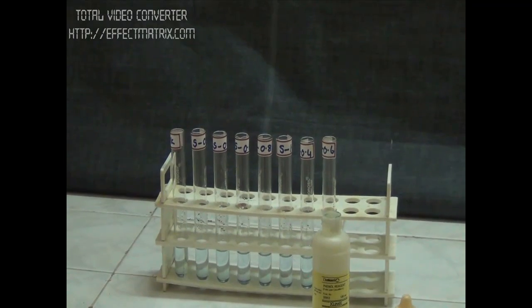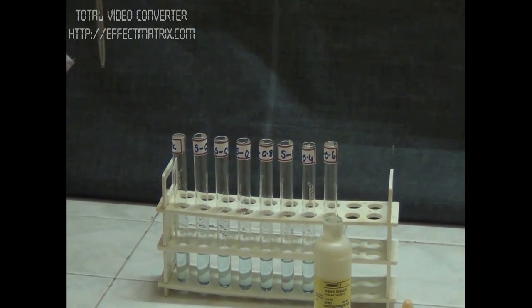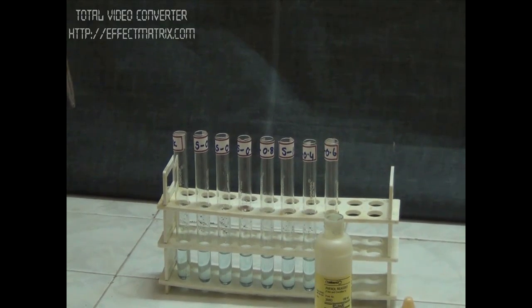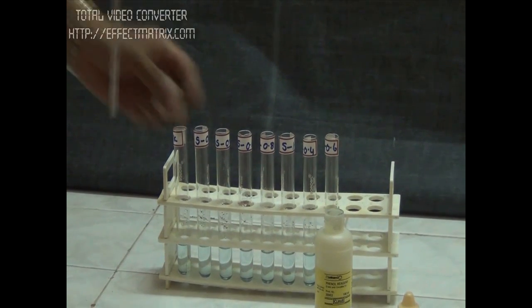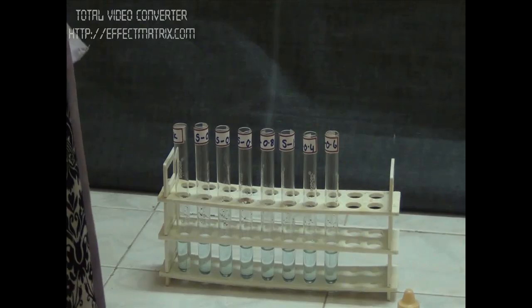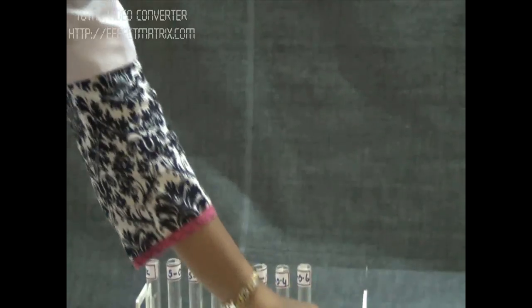After the addition of alkaline CuSO4 and incubation at 37 degrees, we will now add Folin's phenol reagent. We will add 0.5 ml of Folin's phenol reagent to all the tubes.